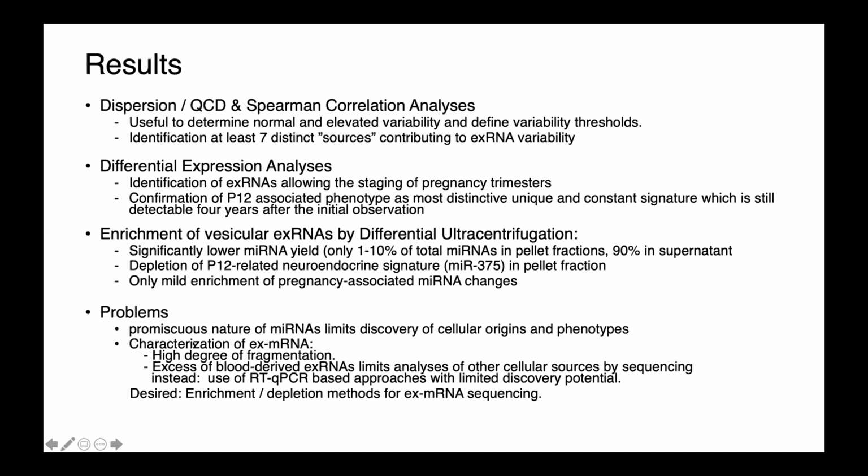We would like to characterize extracellular mRNAs, and Ryan fortunately already addressed several of the problems associated with that. These limitations prompted us actually to switch in related projects to RT-qPCR-based approaches, which, however, have very limited discovery potential. Desired would be enrichment and depletion methods for extracellular mRNA sequencing.